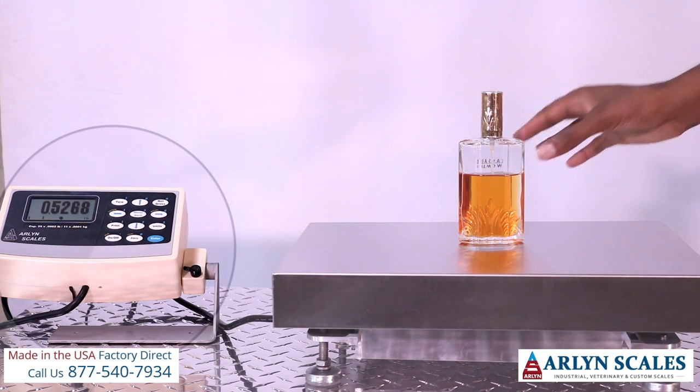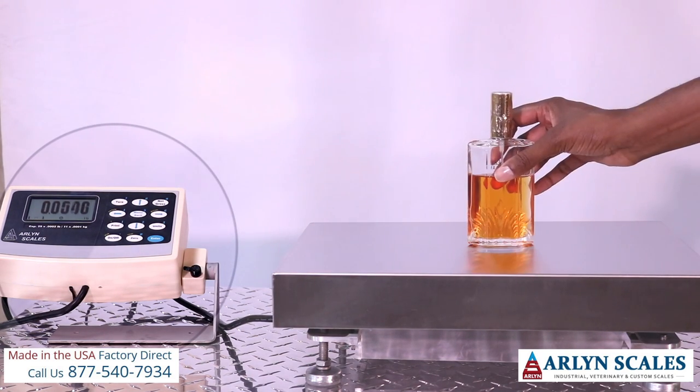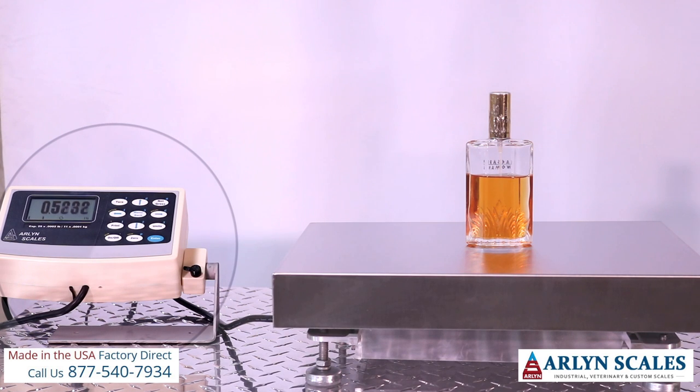I'm just going to spray a few times and as you can see it measured the difference in weight.